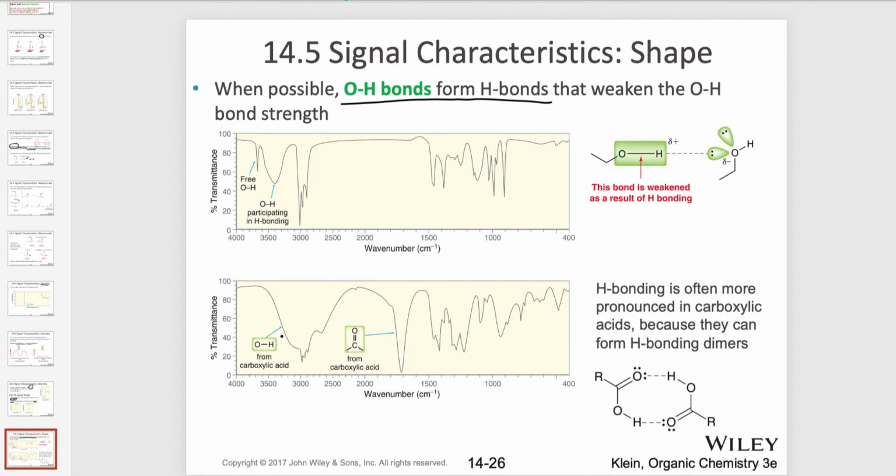And then here, when we're looking at a carboxylic acid, we can have hydrogen bonding here as well. And it's going to be so strong, it actually will start to partially drown out or overlap with, so this is sort of like the OH stretch, and it overlaps with this region here. So those are your CH stretches below 3000 for a saturated carbon, but this OH is very overwhelming. And of course, we also then see always above 1600, we see the double bonds, and this is a strong carbonyl group. So, and I filled out some information on your worksheet as well.